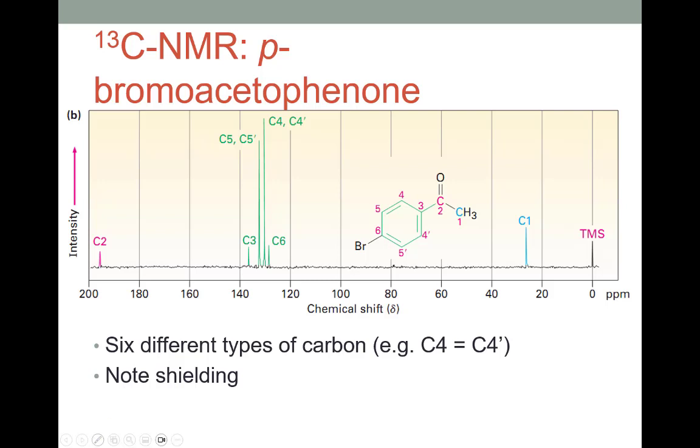So when we look at that, let me pull up my pen again here. There we go. We can see that there's some symmetry on this ring. And so carbon 3, as that bridgehead carbon, is in a unique environment. Likewise, carbon 6 is in a unique environment.